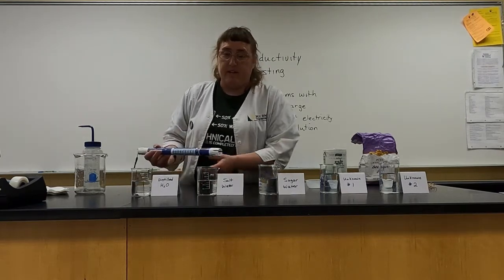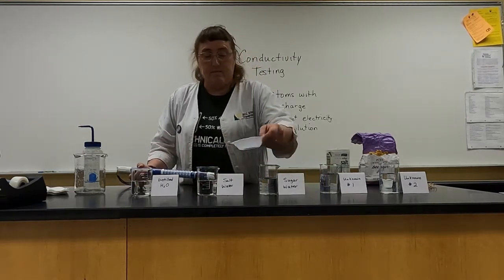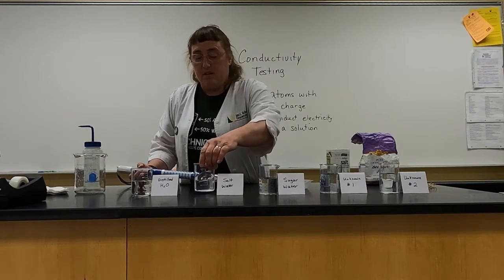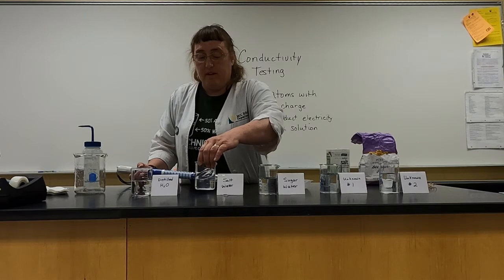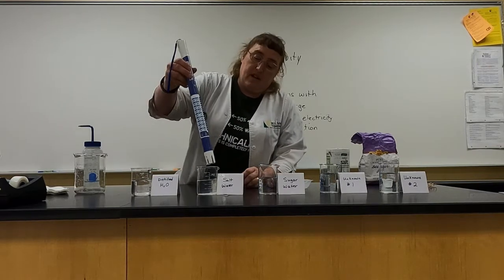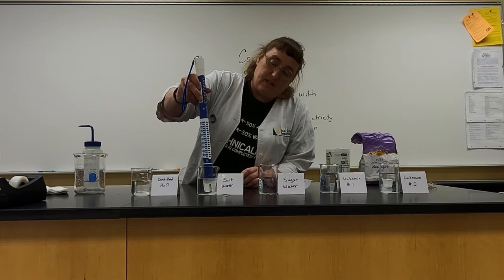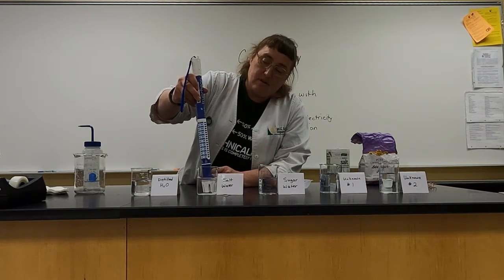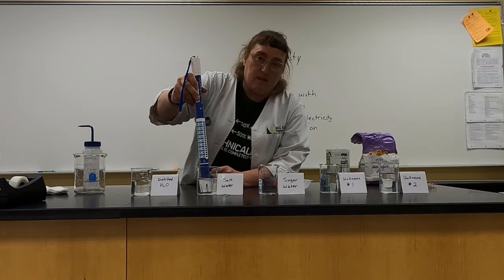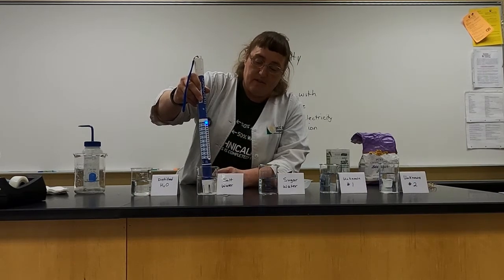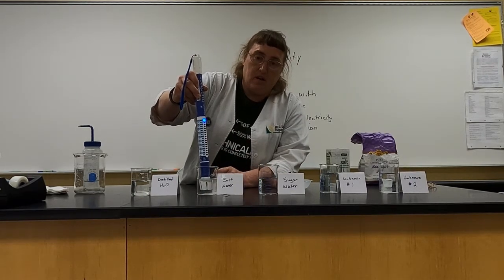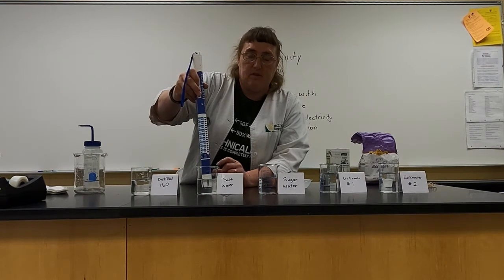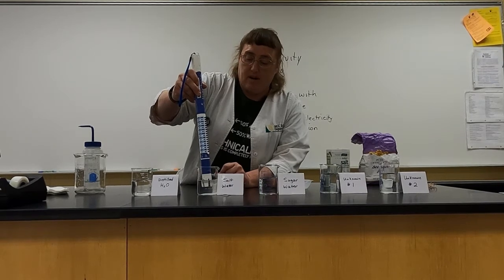The next beaker we have plain distilled water. We're going to add a little bit of salt — this is just regular table salt. You want to swirl it around to mix it a little bit. When you put the conductivity tester in there, notice that it lights all the way up nearly to the top, because sodium chloride, NaCl, splits into the sodium ion and the chloride ion in that water.